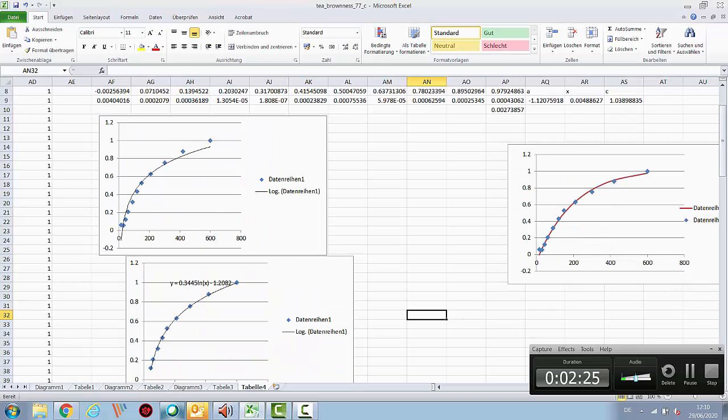So if we go here and try to fit the data, what I've done here is taken only one point at 525 nanometers instead of doing the complicated thing that I was going to do. That's just to get some preliminary data. So this is my curve. You can see to start with, it goes fairly constant, possibly down. So this is 15 seconds, this is 30 seconds.